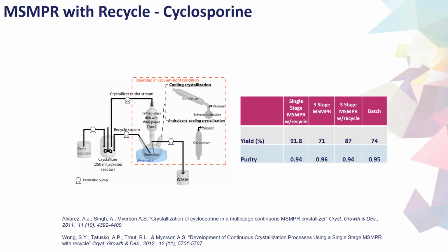There is, however, relatively little material in the literature on continuous pharmaceutical crystallization for the purposes of purification, although there are a couple of notable studies. So the batch crystallization methodology is used. A slow batch crystallization conducted over many hours unagitated is quite a powerful purification technique, as mentioned already. However, when you push crystallizations to go faster and faster, so if you conduct them at lower batch times by accessing higher supersaturations, typically or commonly, the purification efficiency of that operation can be driven downwards. So the ability to purge impurities is reduced.